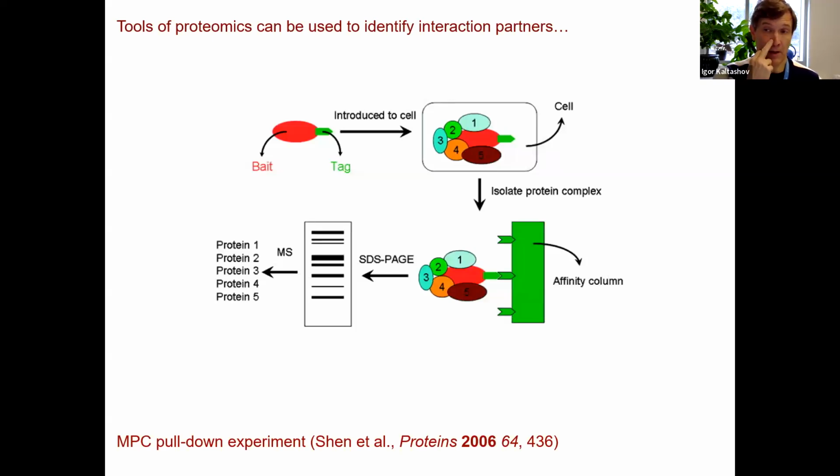And fortunately, mass spectrometry offers several other ways to look at higher order biomolecular structure, including very large protein complexes. And in many cases, that allows you to really deduce very detailed information about this high order structure of biopolymers that is frequently unavailable from other sources, right?